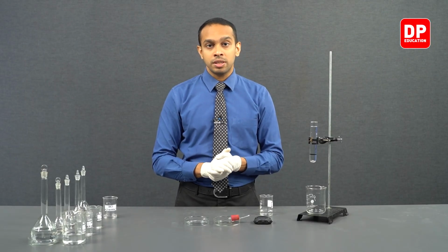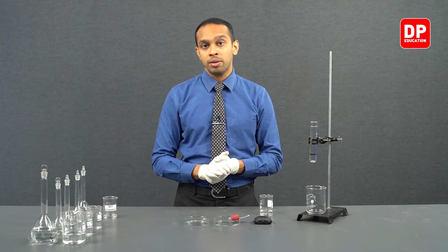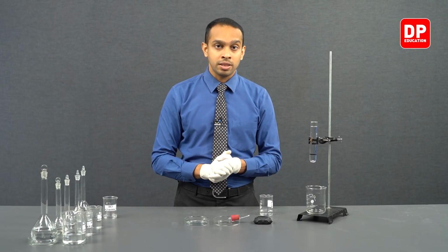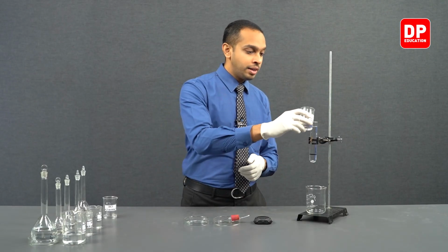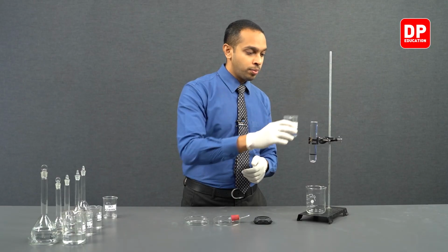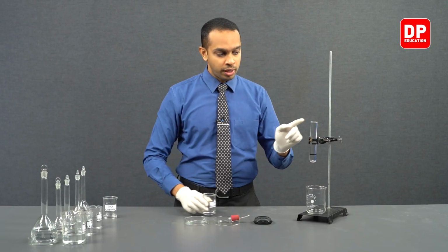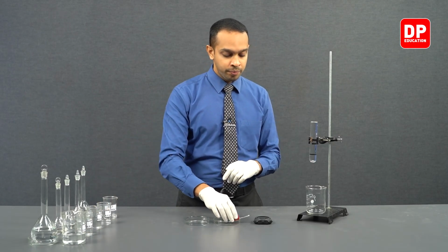So this will interfere with our readings when you are trying to measure the time that it takes to collect a certain amount of hydrogen gas. So please make sure that you add HCl all the way to the top. Now you can see HCl is filled all the way to the top.